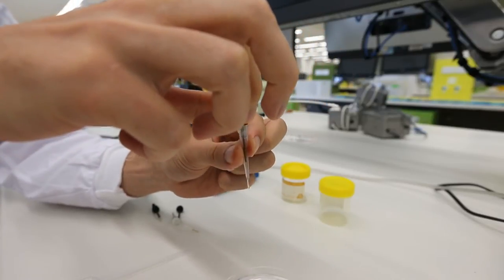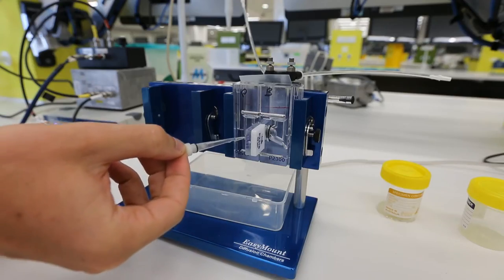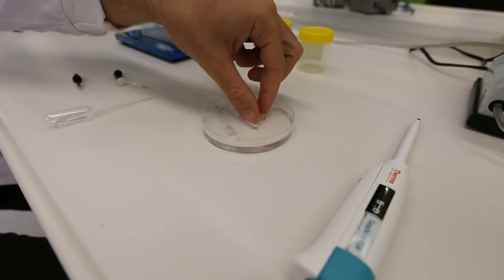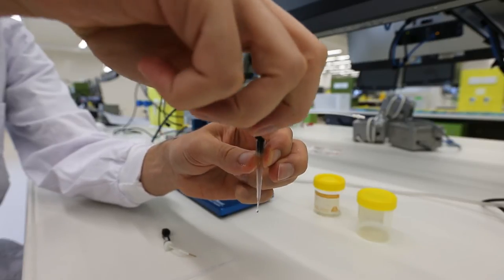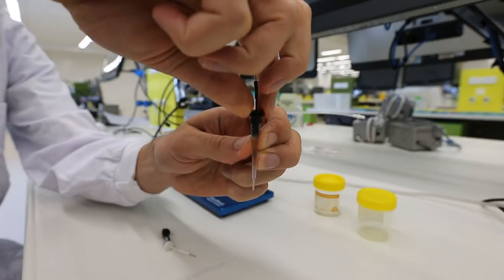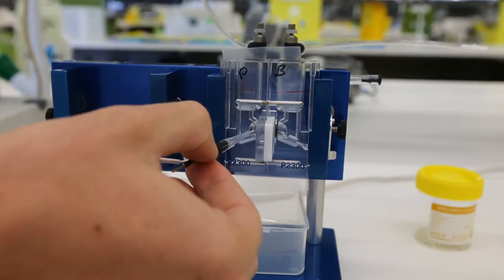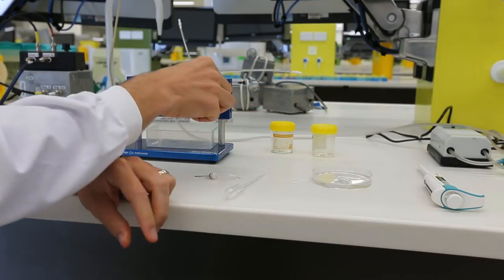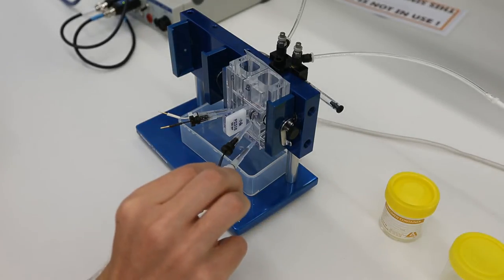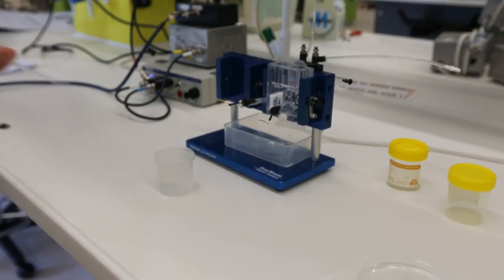Twist the electrode to secure it in place, and then insert the assembled electrode into the left-hand side of the Ussing chamber, as shown here. Next, take a black electrode and secure it in place as before, being careful not to introduce any air bubbles, and then insert this electrode into the Ussing chamber, again as shown here. Repeat for the remaining two electrodes. In the assembled chamber, you will notice that the two white electrodes are outermost and the two black electrodes are innermost, next to the tissue holder. Ensure that your chamber is set up in the same way.